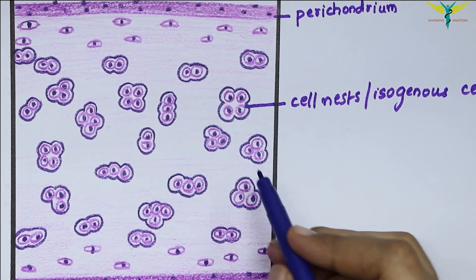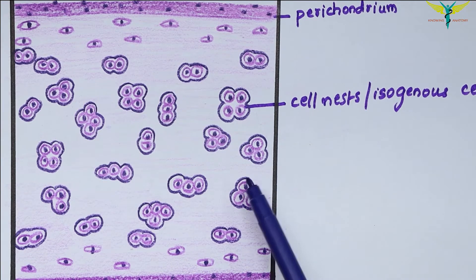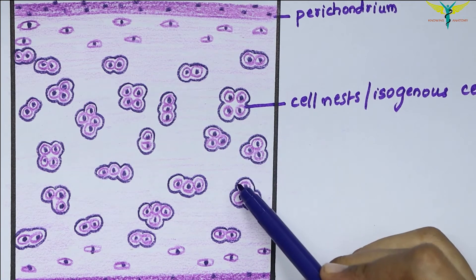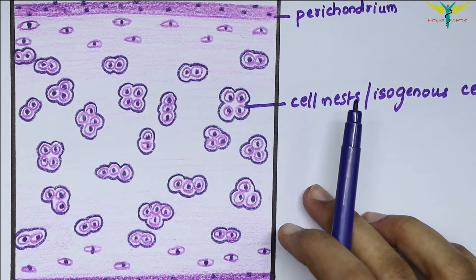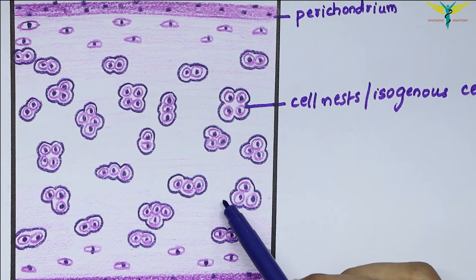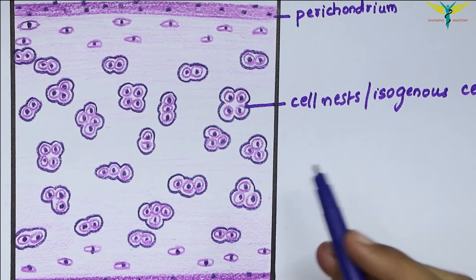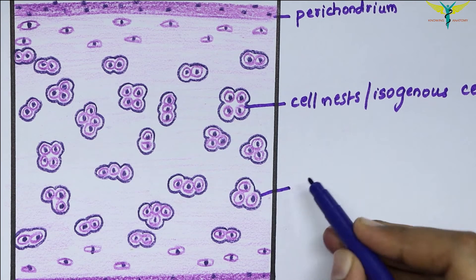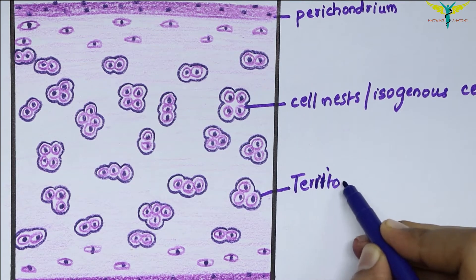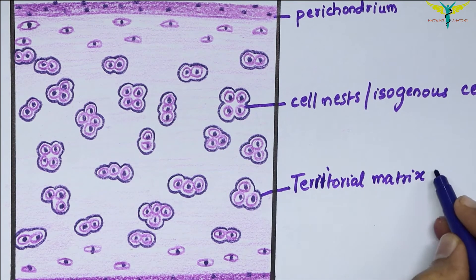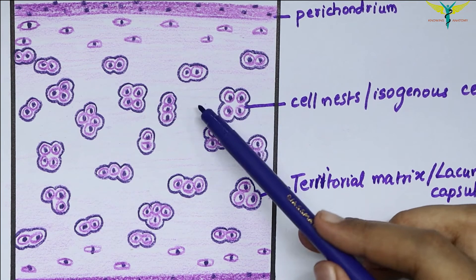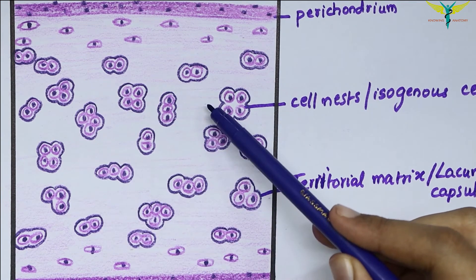This white color gap is called as the lacunae. Around the cell nest, the matrix stains deeper than the surroundings and gives an appearance of a capsule. This deep staining matrix is newly formed and is called as the territorial matrix, and it is also called as the lacunae capsule. This pale staining matrix is called as the inter-territorial matrix.